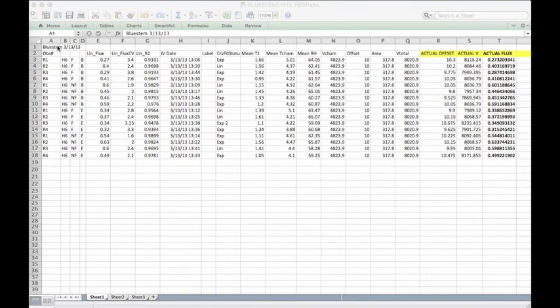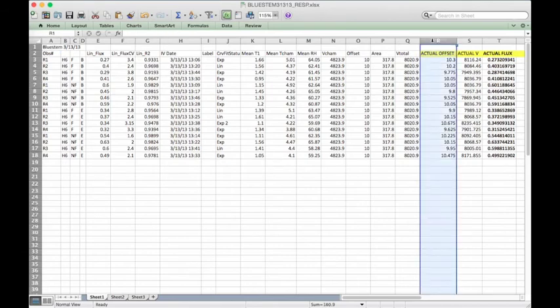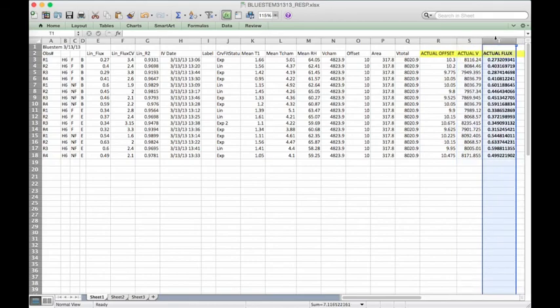An easy way to do this is in a spreadsheet like this one. We have all of the measurements taken by our instrument, and the offset of each collar here. We can then correct for each offset and calculate our actual flux here.